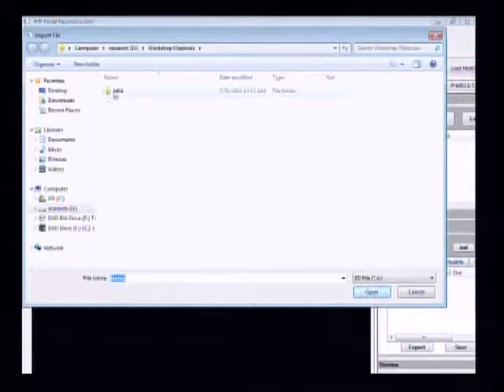So the first step we're going to do is loading the segmented bone model, all right? So if you go to your desktop, workshop materials, M64, you'll find a file called segmentedsurface.iv. So let's load this file.